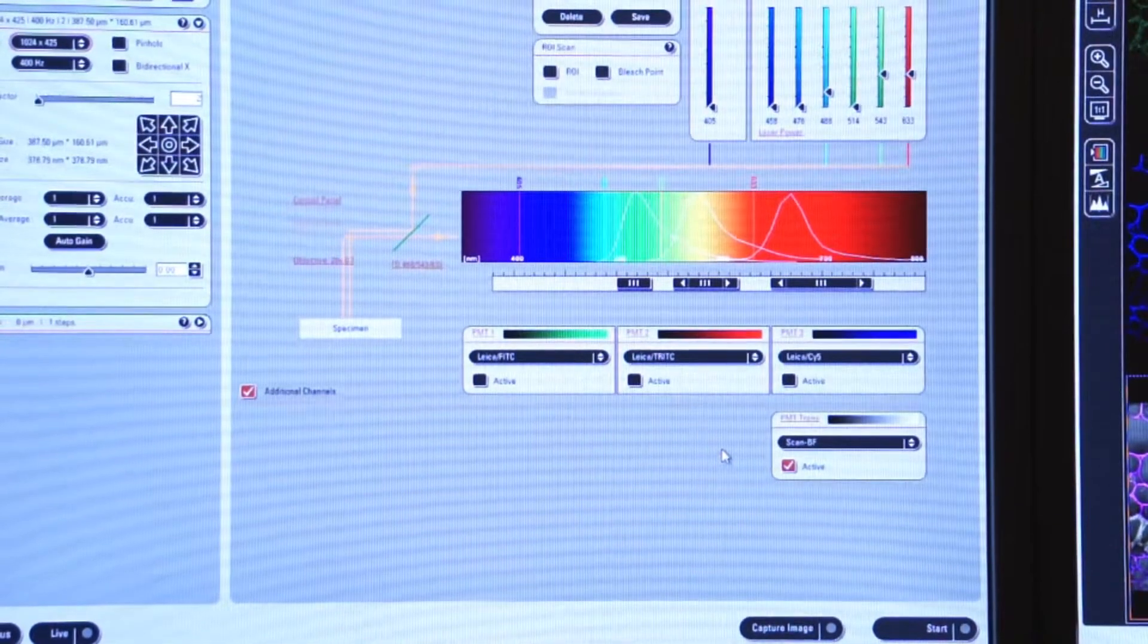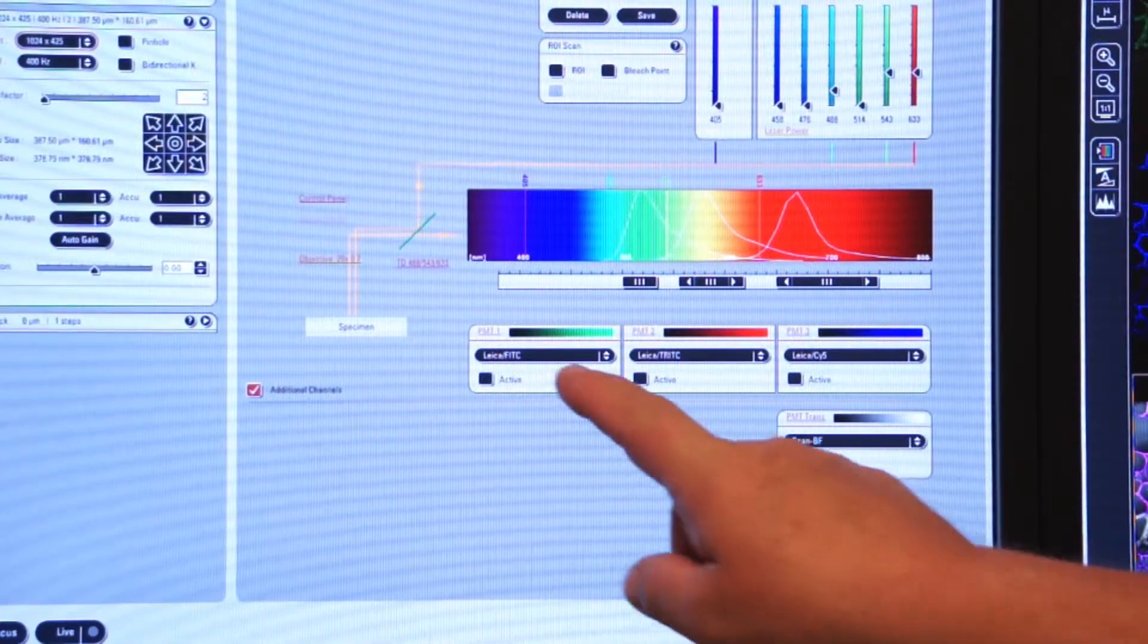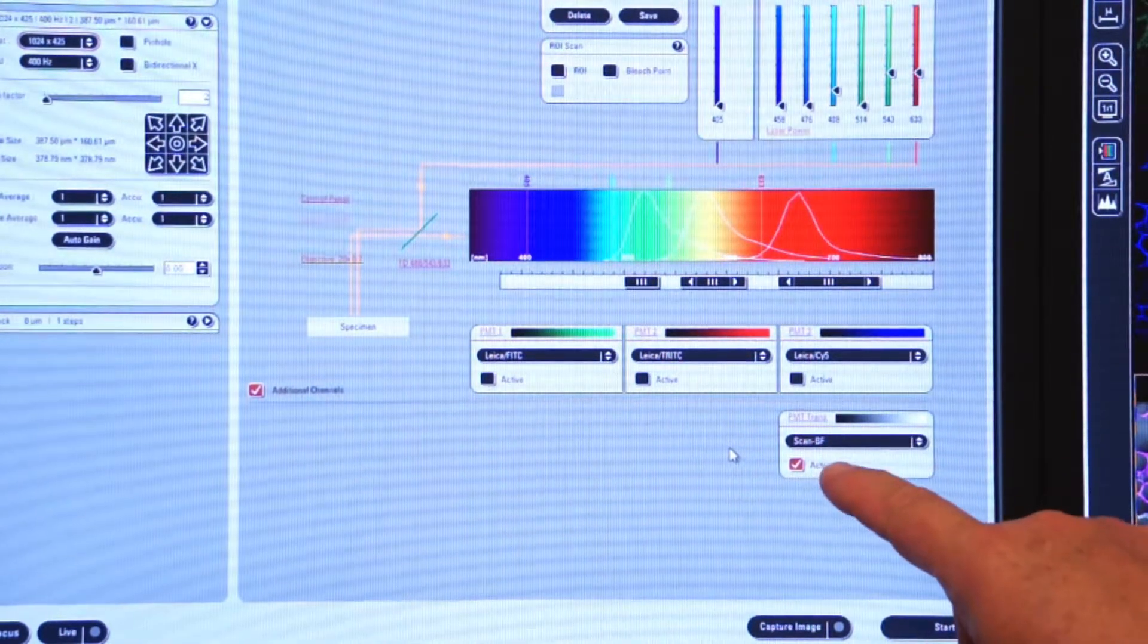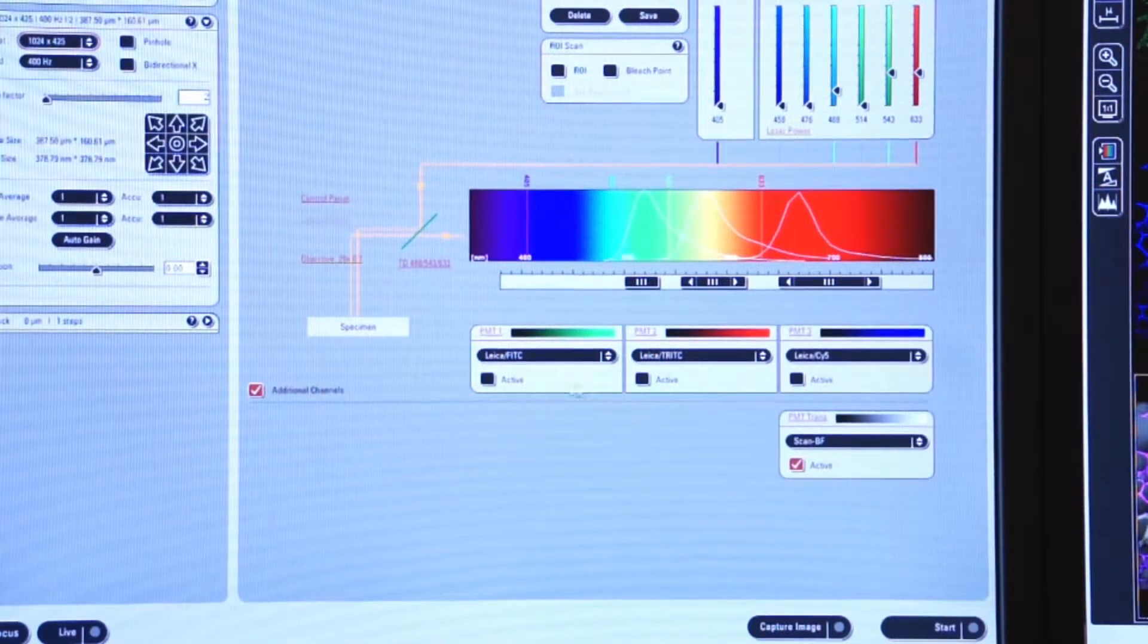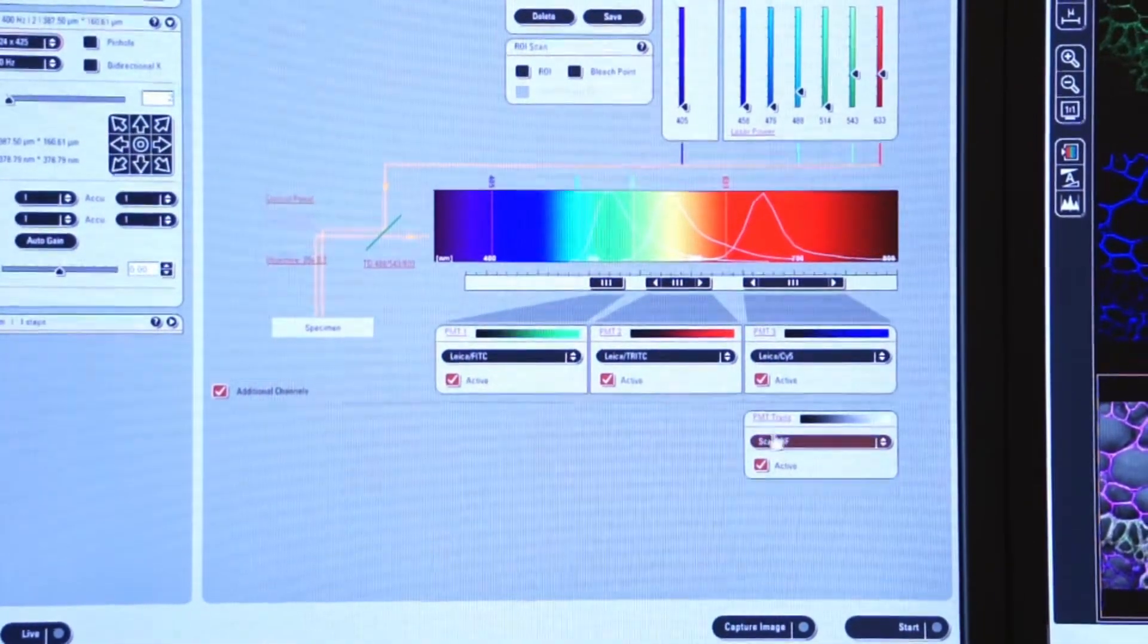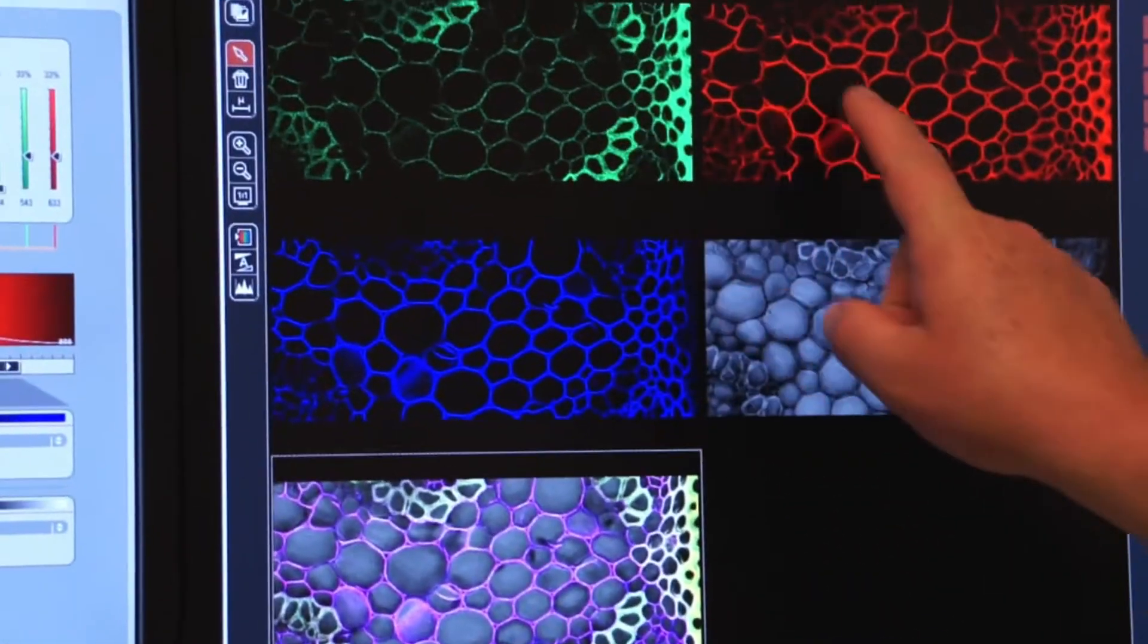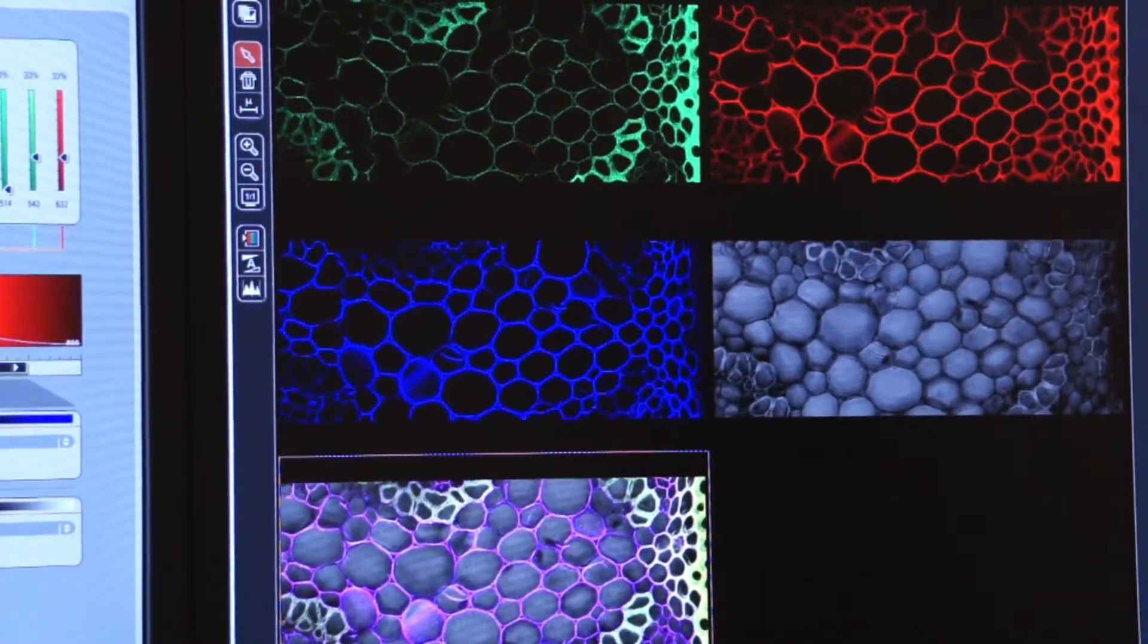There is also the possibility that I may want to use all four PMTs simultaneously. I might have three different fluorophores that I'm looking at, and I also want to use the transmitted light PMT, which we've already used. So let's turn them all on and look at our image. I'm going to activate the PMTs. All four are now activated, including the transmitted light PMT. We'll click on live. And now if you look at the right screen, you see all four of our PMTs illuminated together with our composite image.